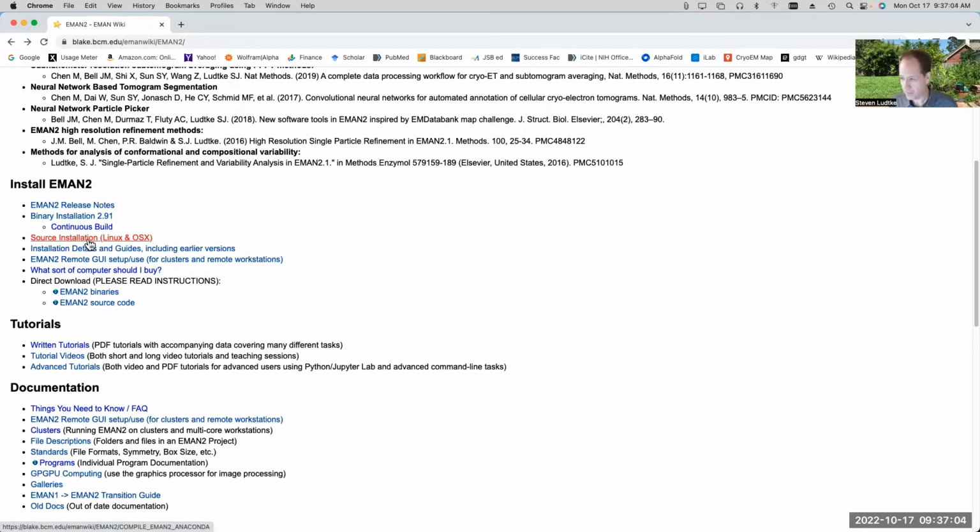If you really don't feel competent to do that, you can do a binary installation, but if you do that, use one of the snapshot versions, not the 2.91 release version. For the rotation students, Eric and I can help. I think we're both pretty good at the installation. Yeah, sure.